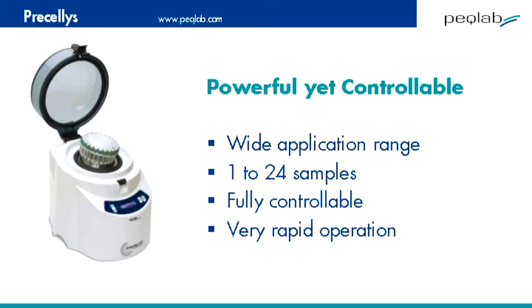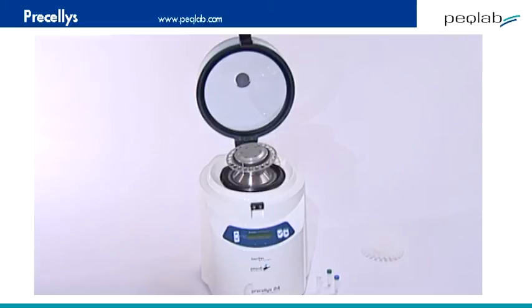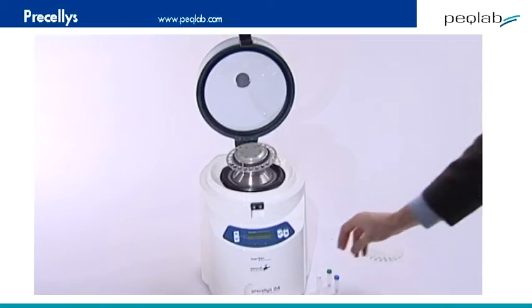It works with 2 ml tubes, taking up to 24 tubes in each run. It's very easy to load and use, so let's have a look at it. Here's the Pracillis 24, a benchtop-sized piece of equipment with a clear lid.